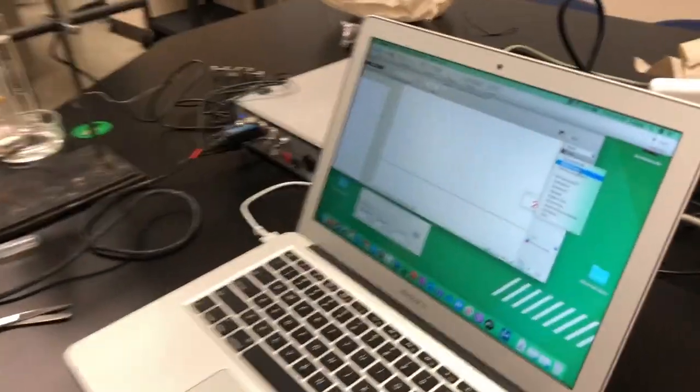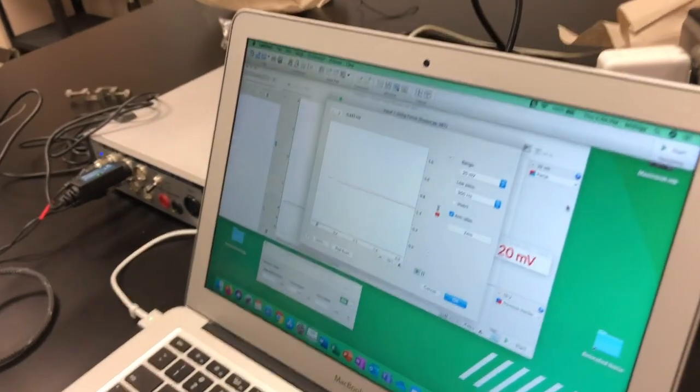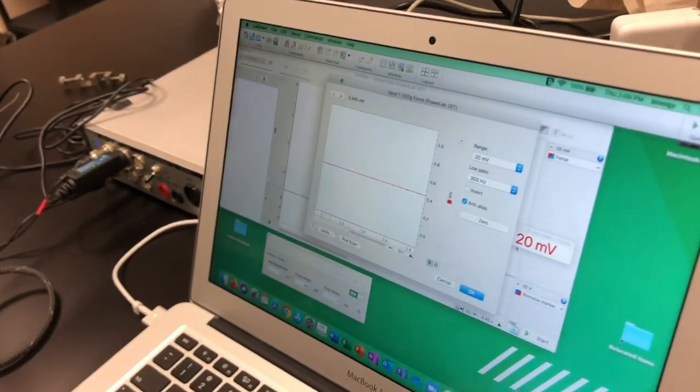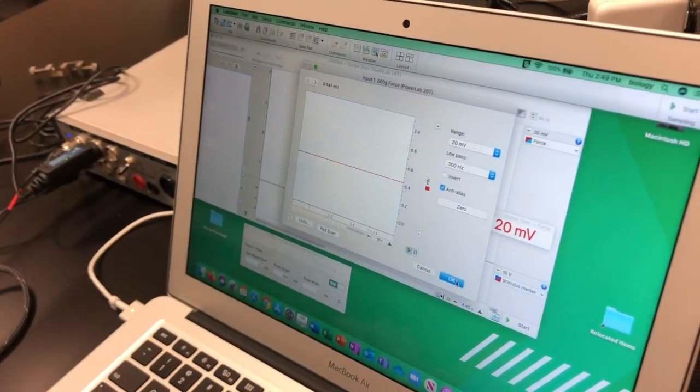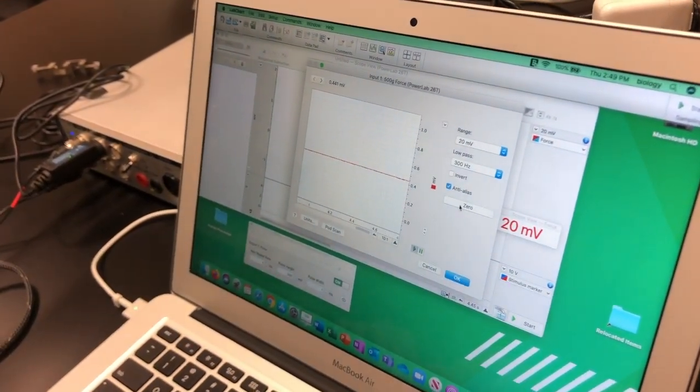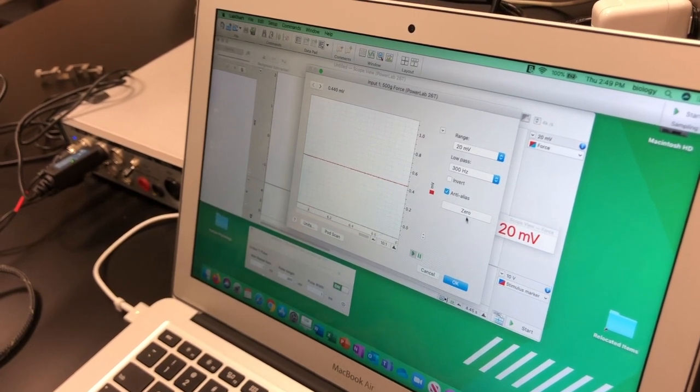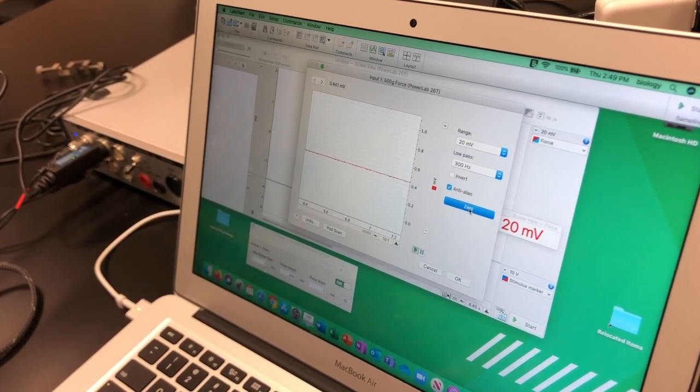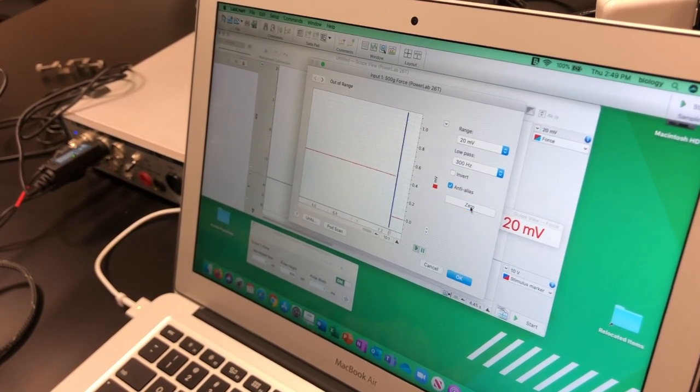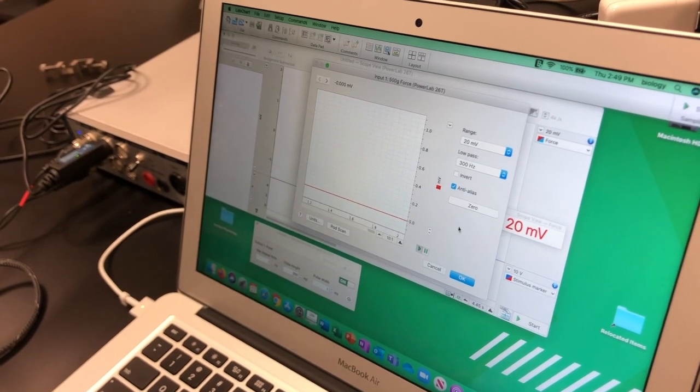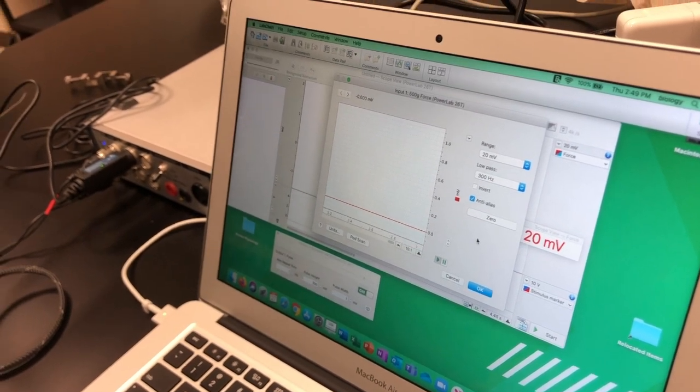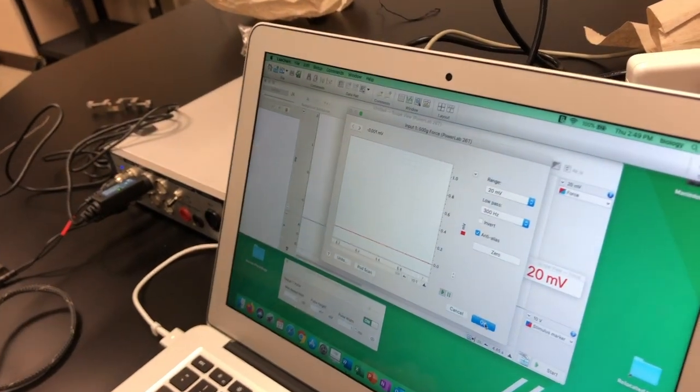What we're going to do is just make sure that the force transducer is working, so we're going to zero it. And you probably won't have to do this, we'll probably do that for you. And then you can kind of give it a little bloop just to see if it was working.